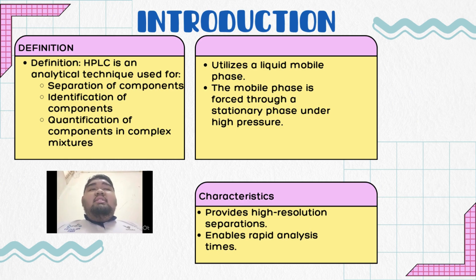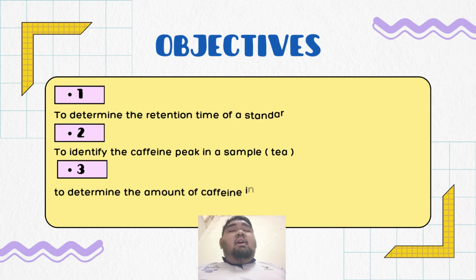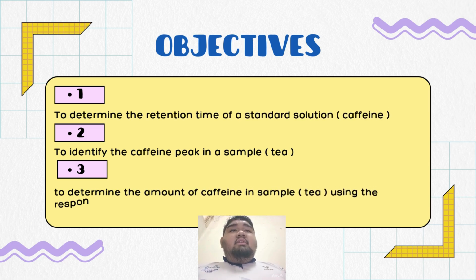The characteristics of HPLC are: one, it provides high resolution separation, and second, it enables rapid analysis times. For our video presentation today, we have three objectives to complete.